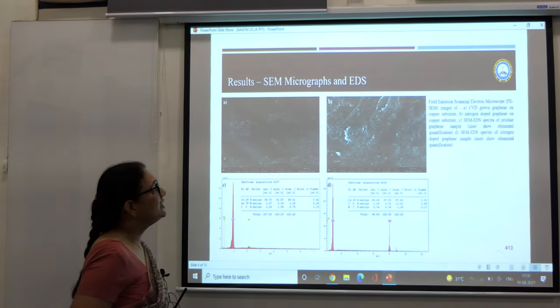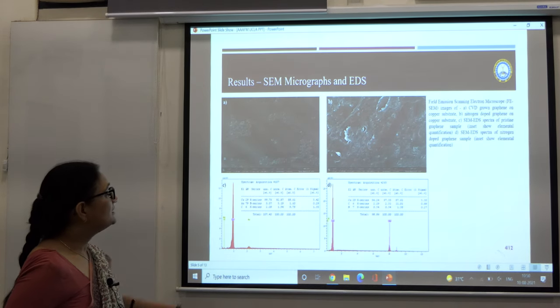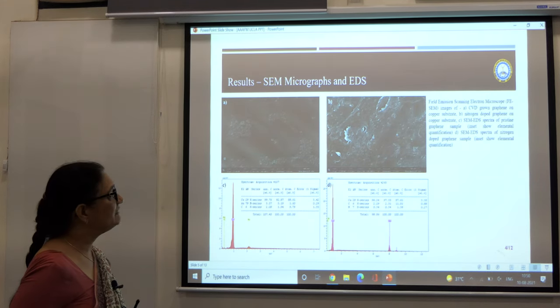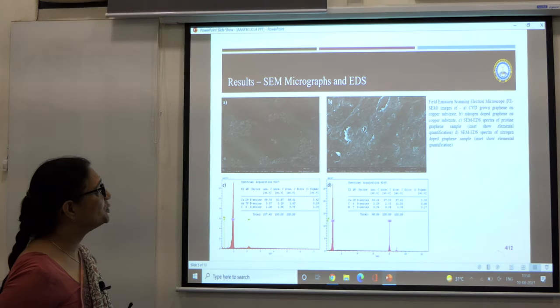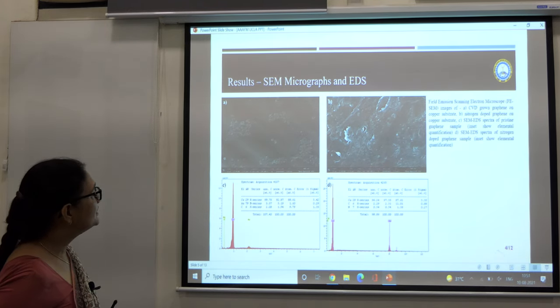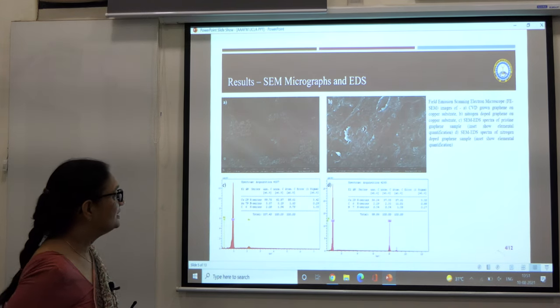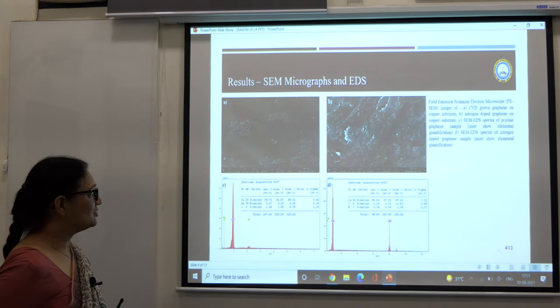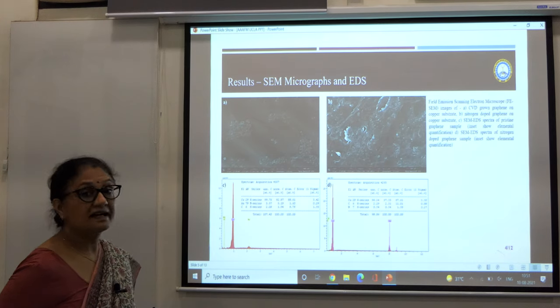This gives you the nitrogen doped graphene on the copper substrate. At the lower side, the EDS spectra of the pristine graphene and the EDS spectra of the nitrogen doped graphene sample are given. We can very clearly see the presence of nitrogen there. The peak here gives you the presence of nitrogen, so the EDS spectra confirms the growth of the desired samples.